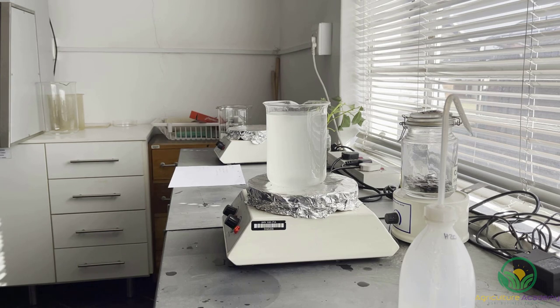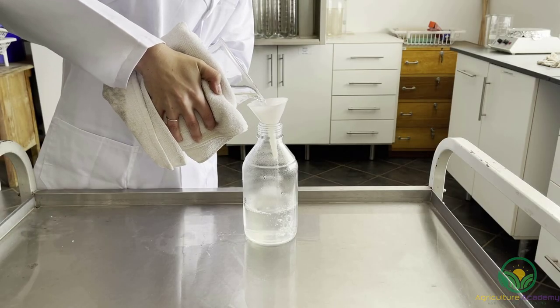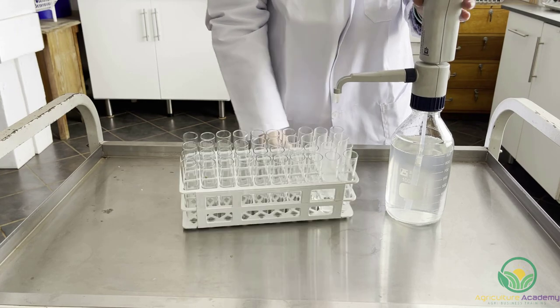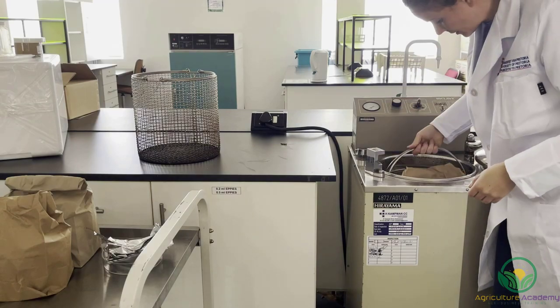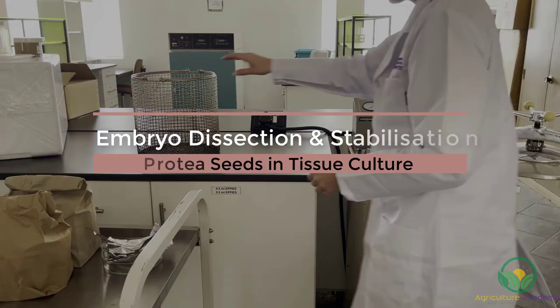we filled a glass beaker with 600ml of distilled water and added the necessary amounts of MS powder, sucrose and gelrite. Then more distilled water was added to meet the 1 litre mark. The beaker was placed on a heated magnetic stirrer for about 60 minutes to heat up and dissolve all of the solutes. Once the mix turned crystal clear, the medium was transferred to a Scott Duran bottle and a pump was used to transfer 10ml of the medium into test tubes. The test tubes were sealed with lids and placed in an autoclave, along with glass bottles containing distilled water, bleach and ethanol solutions, which will be used to sterilize the seeds later.